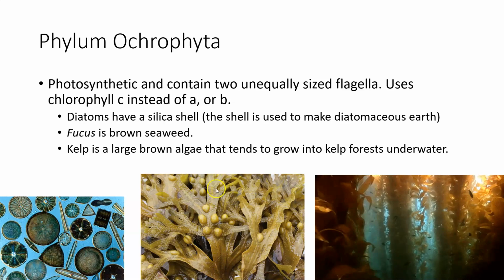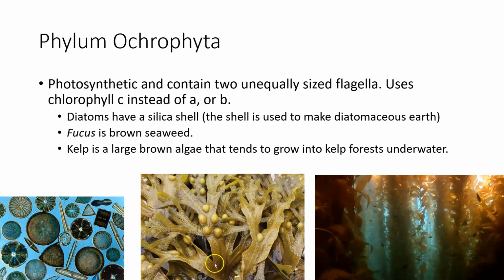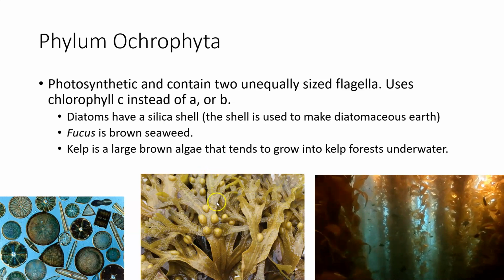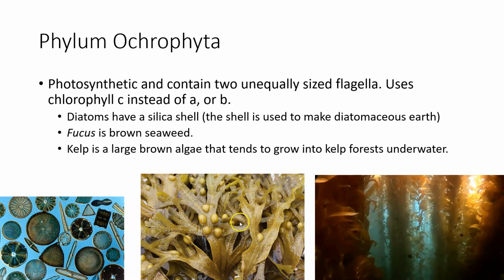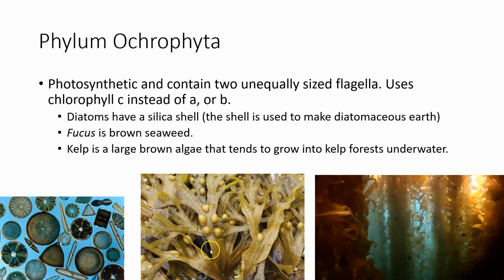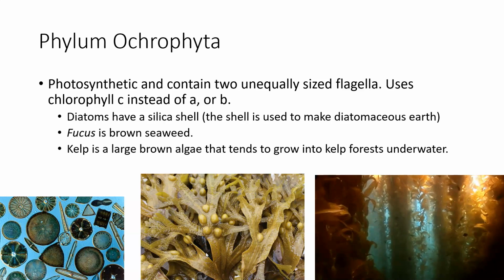Now, one of the things to notice is it's plant-like. It's greenish. It's really called a brown algae, but whatevs. It's got these little air bubbles in it that help it stay towards the top of the water. Think sort of like a swim bladder, but for a plant-like thing instead of for a fish. And it's almost always sort of vaguely slimy. So that's what you should doodle in the space that they have given you on page 284. This is for your fucus.